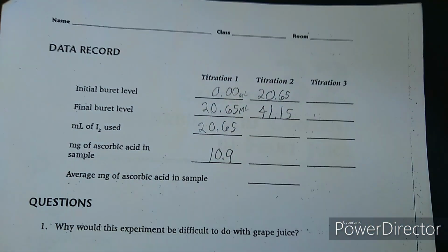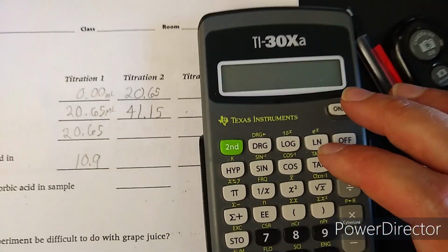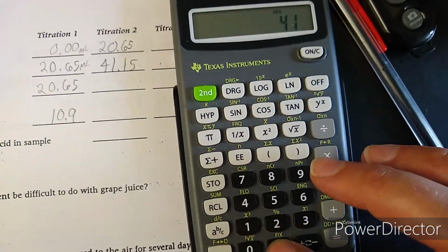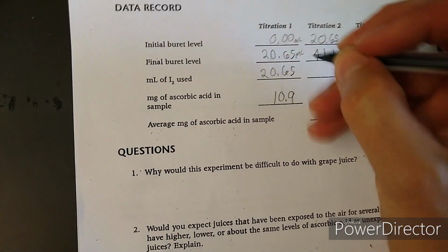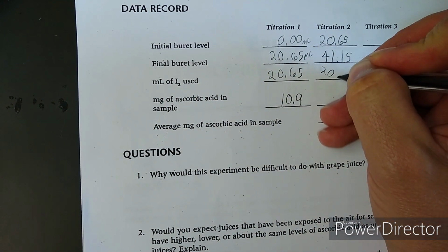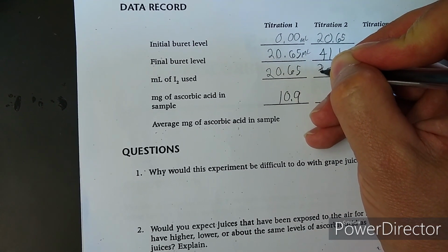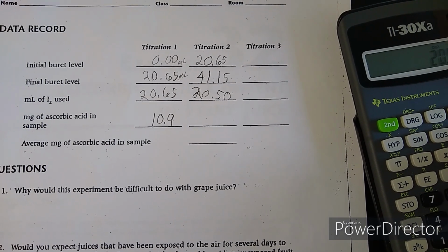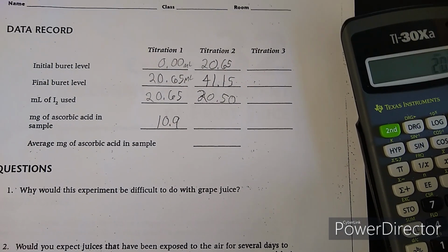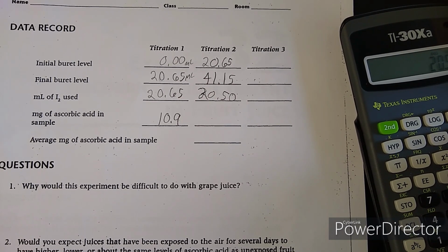And so we subtract those two to see how many milliliters of iodine was used. I think that's going to be right on the money, practically the same value. 20.5 for the second titration value. 20.50 if we keep all those significant figures in there, right? And that is definitely a small margin of difference. So we don't practically have to do the third titration because we did so good on the first two titrations.